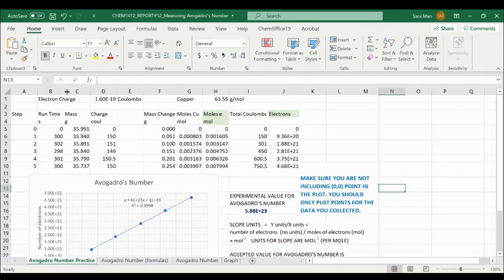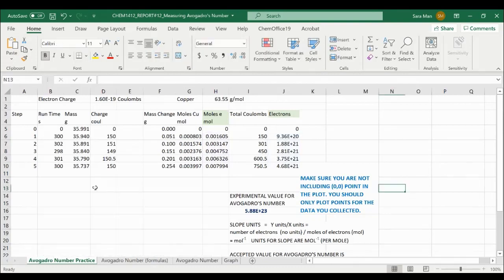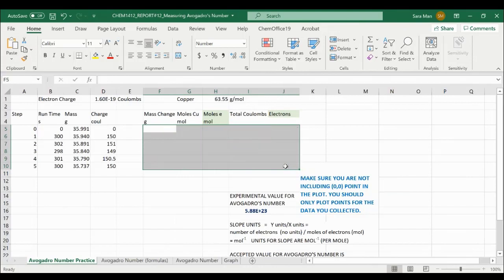So you will have to start preparing a table like this. Let's erase this, so we will do it together. And let's erase all this. We will do it together. And the raw data is on the left. So prepare a spreadsheet when you start, similar to mine.